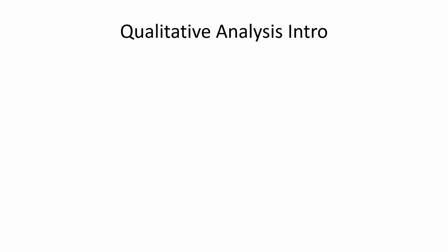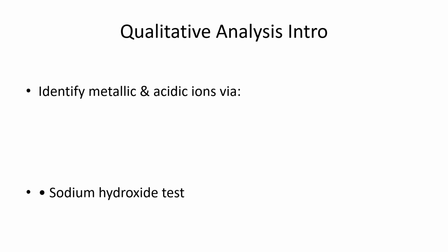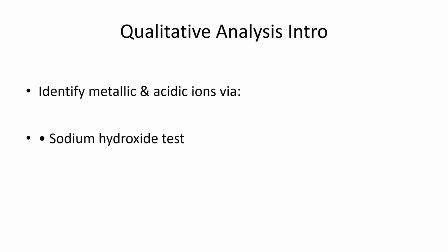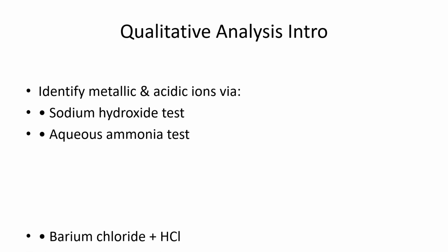Let's move to the analysis of an inorganic salt sample. Once dissolved in water, 3 separate tests are conducted. Test 1 using sodium hydroxide. Add aqueous sodium hydroxide dropwise, then in excess. A precipitate may form. Observe if it dissolves or remains. If a precipitate is formed, we have to state the color too.